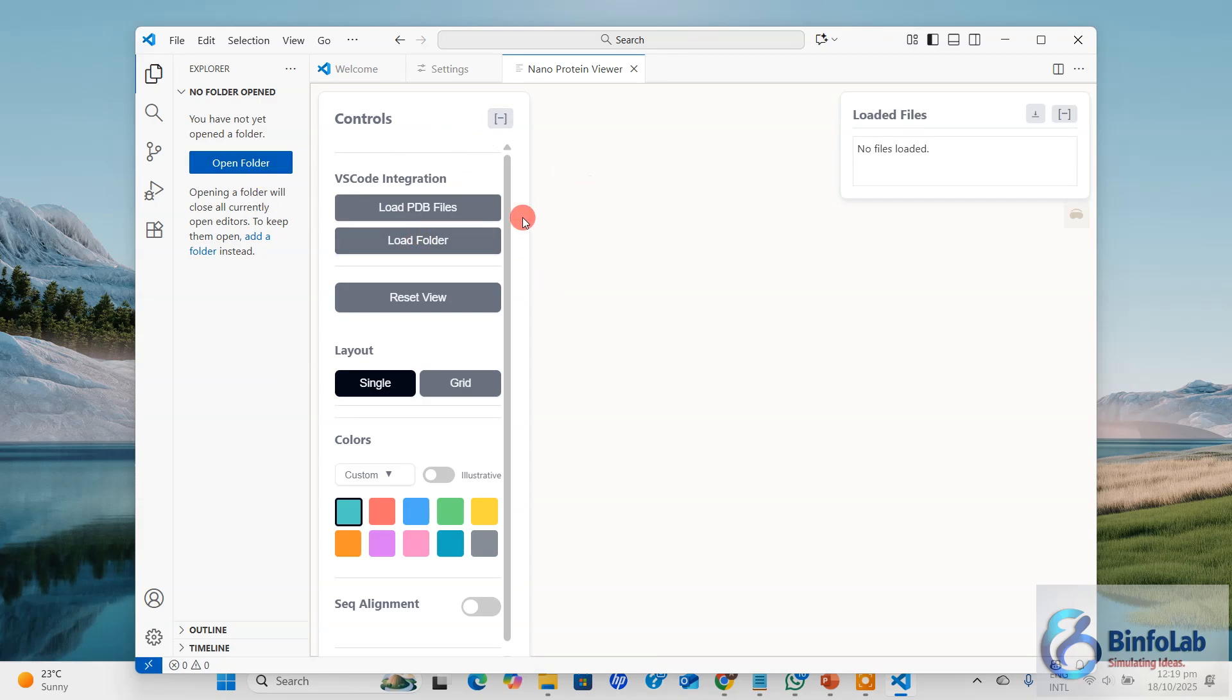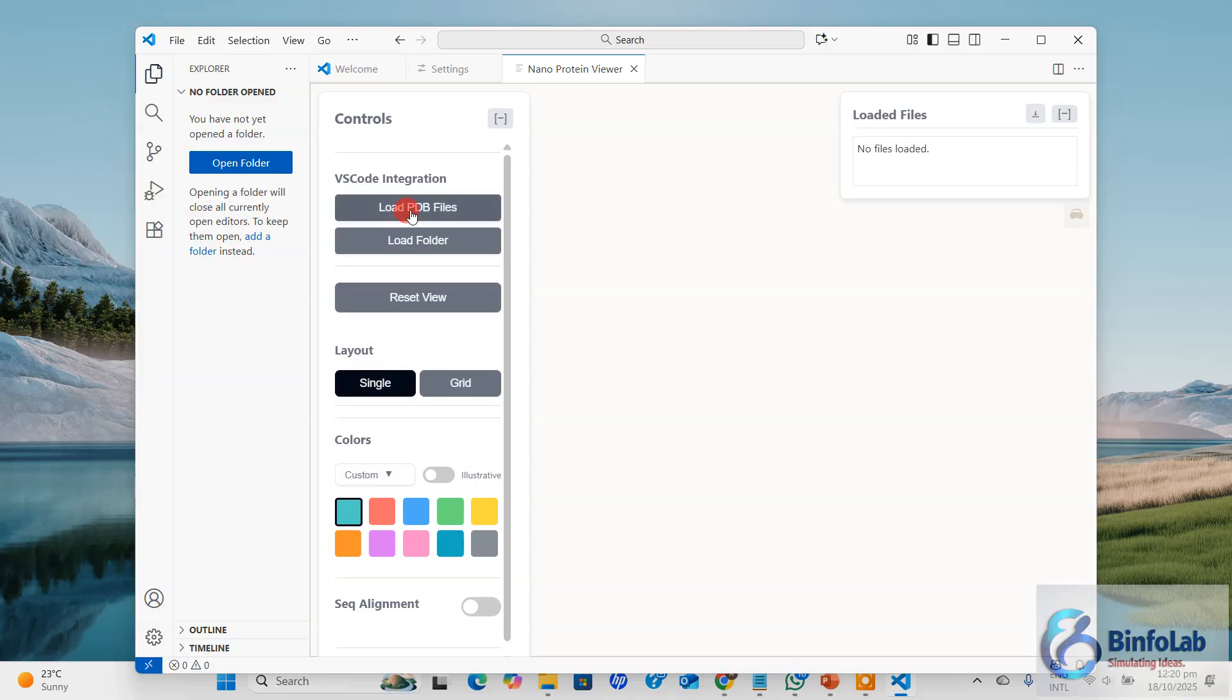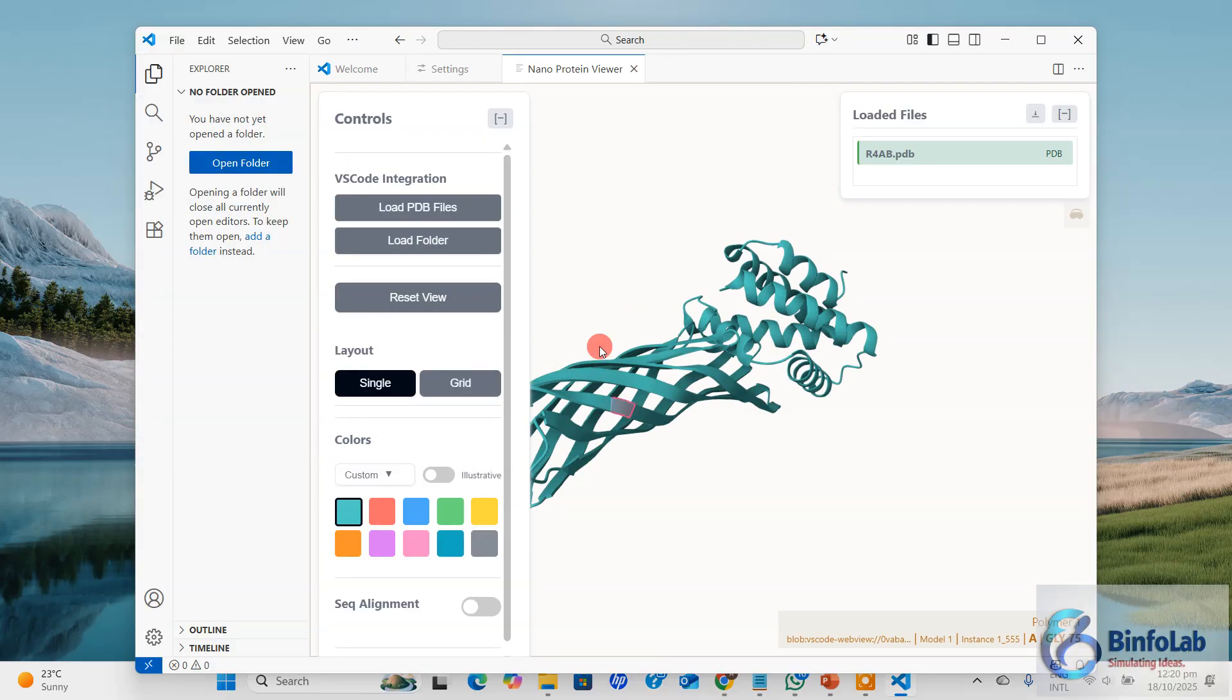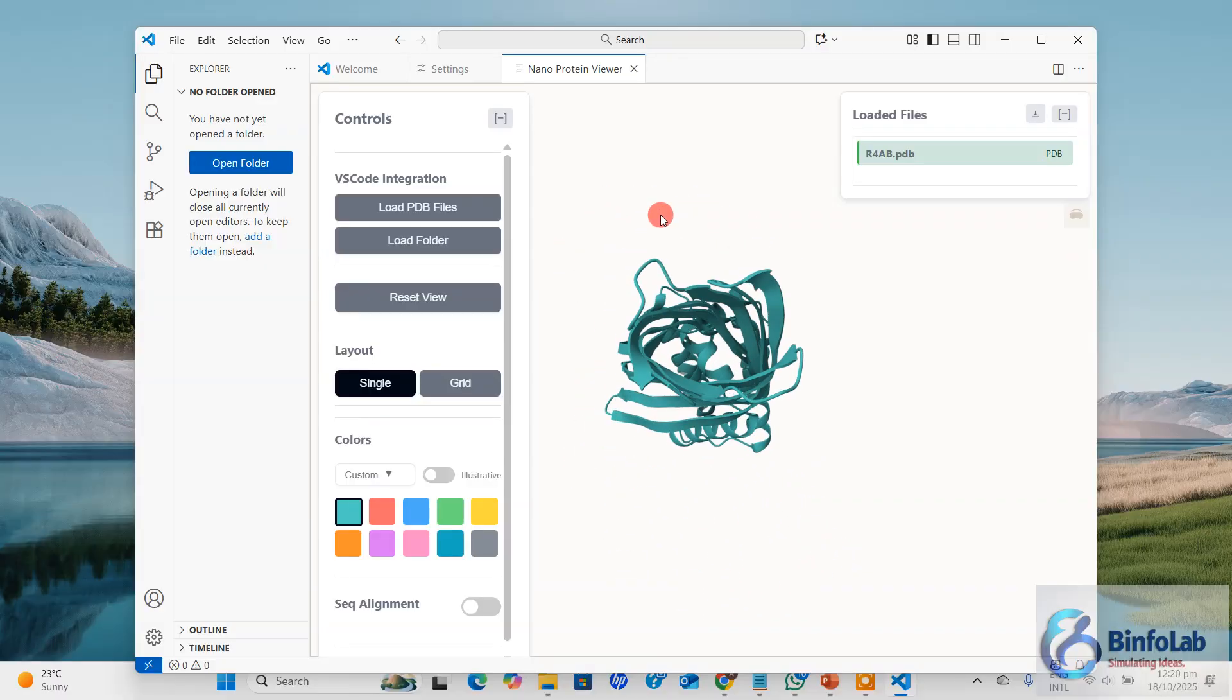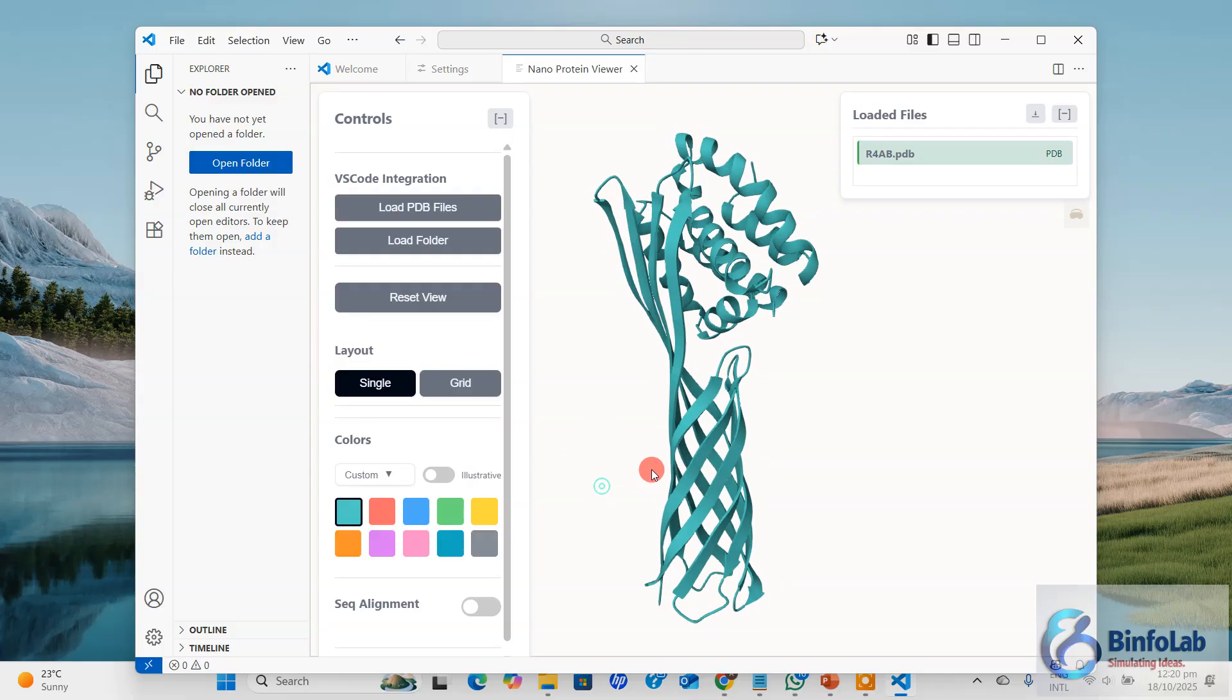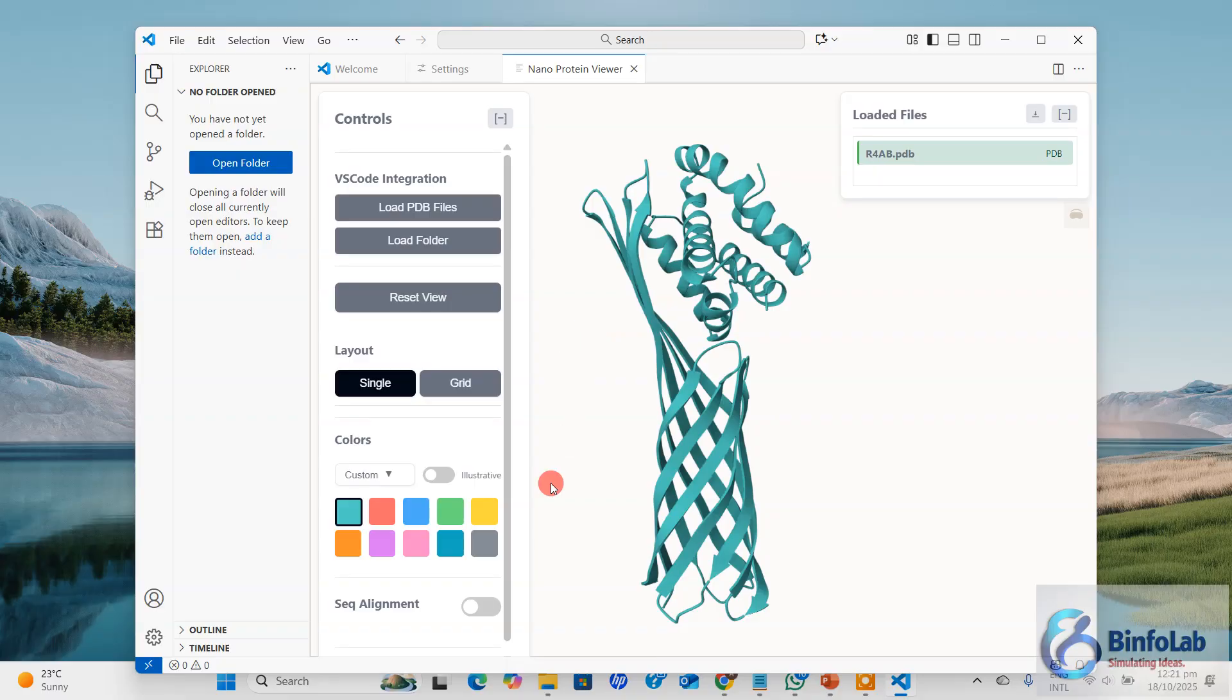Now I'm going to load and perform some basic operations quickly. You can load a single PDB file or load the whole folder. It supports the grid options as well. Right now, I will load a single PDB file. I'll click this one from my download folder. You can see this figure - it's a picture from a protein design.